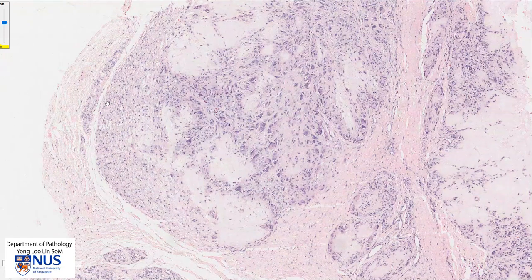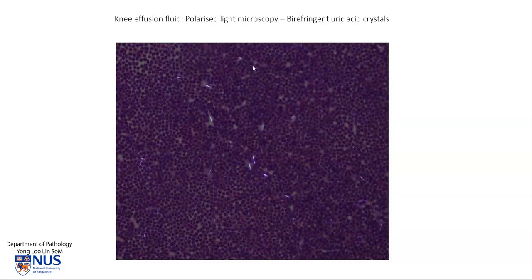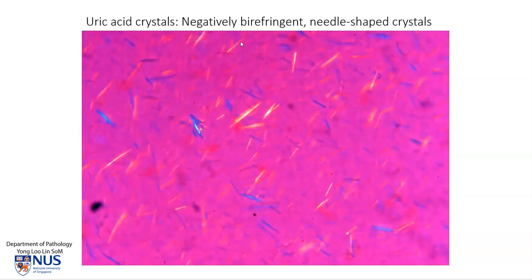Let's have a look at these uric acid crystals in a fresh specimen. This is taken from a needle aspirate from an effusion of the knee. Examination under polarized light microscopy will show these birefringent needle-shaped uric acid crystals. With a color filter in the microscope, we can assess whether they are positively or negatively birefringent.